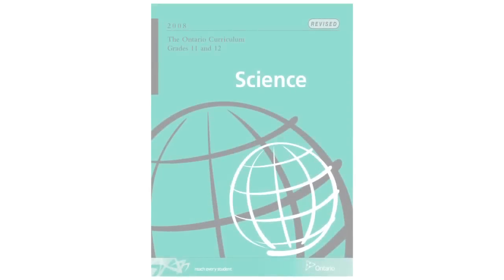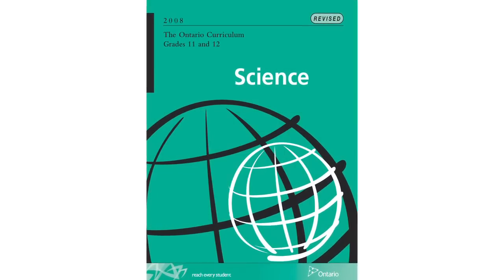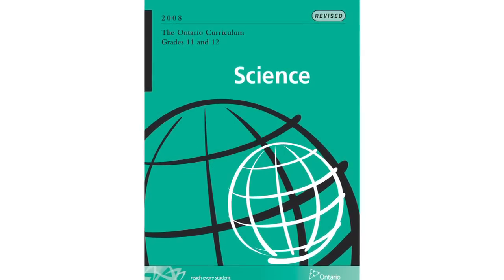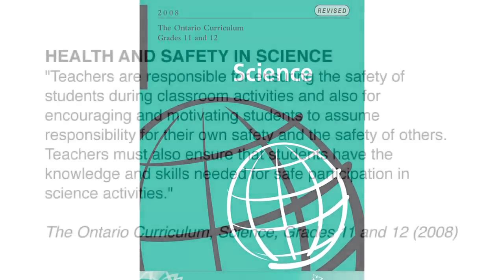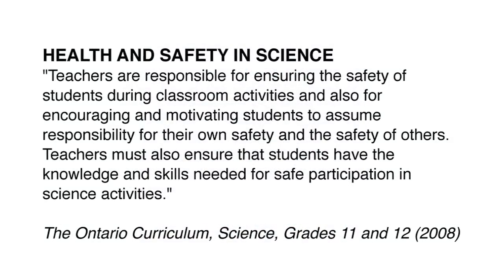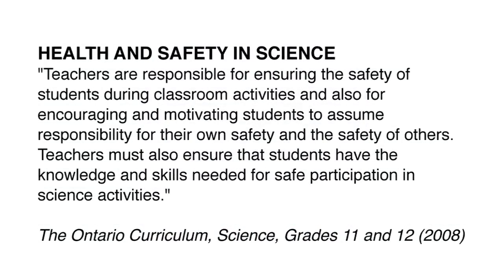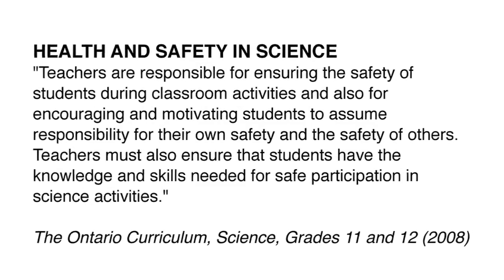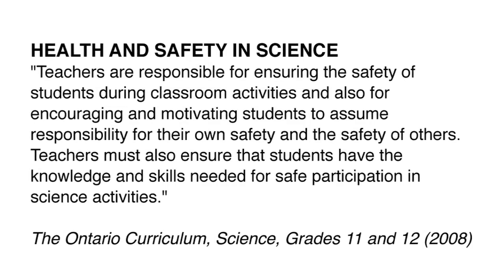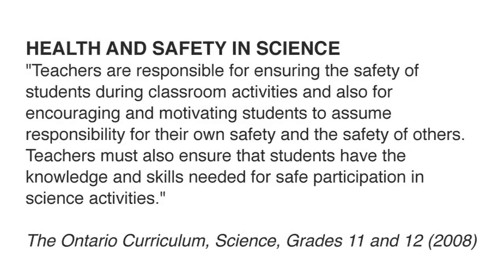Ester synthesis requires the use of concentrated reagents for the reactions to proceed. Therefore, it is essential that the quantities of the reagents used in the reactions are kept to a minimum. It is presumed that grade 12 students have the necessary skills to work safely with concentrated solutions. However, the teacher should always employ his or her discretion and personal knowledge when deciding whether or not a particular group of students is ready to work with concentrated solutions.